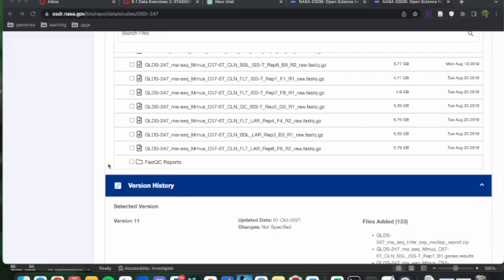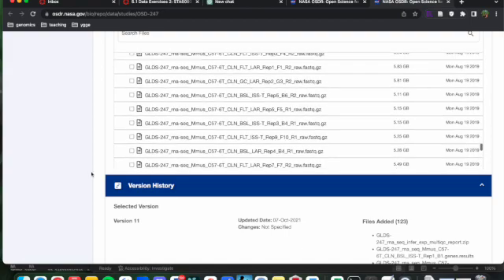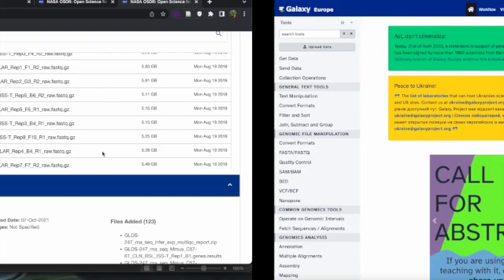This is a tutorial for RNA sequencing processing pipeline without coding, for paired-end reads. There's a really good tutorial for single-end reads but not really for paired, so I'm going to run through that today using Galaxy. Shout out to Sam — this tutorial is for you. First thing you want to do is collect all of your reads: read one is your forward, read two is your reverse, and each sample should have both. Once you download all of those, go to Galaxy.